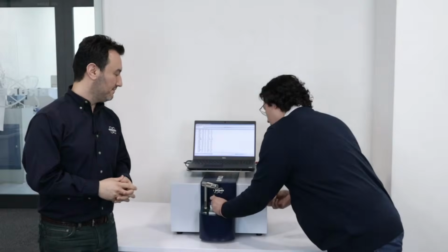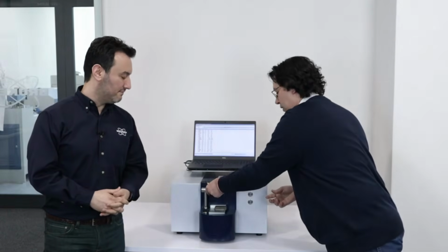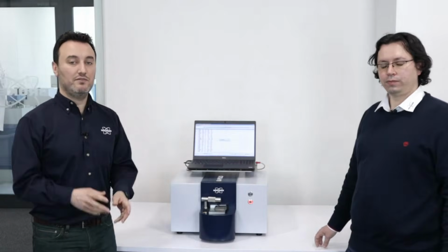Yeah, and thank you. And we're gonna do a last burn here on this sample. Yeah. And so one really important step that we have for the measurement of a sample with OES is sample preparation. Can you give some examples? Yeah, when it comes to sample preparation, actually we have two methods. One is for the hard matrices. We grind them with a sandpaper, either 60 or 40 grit.